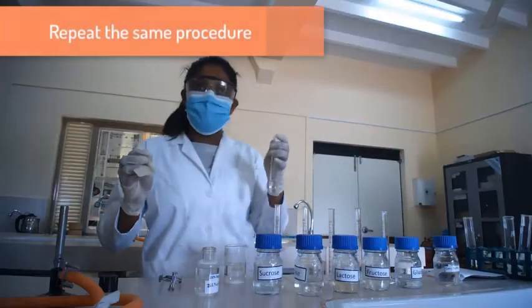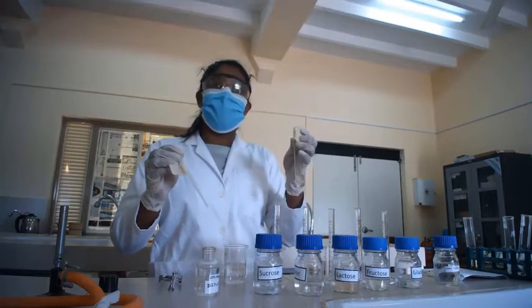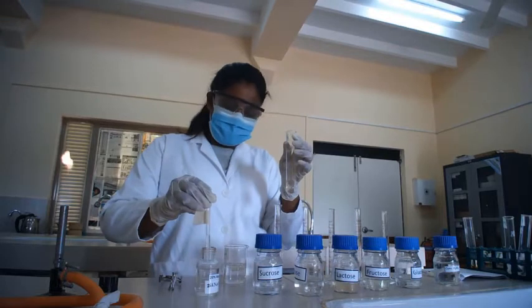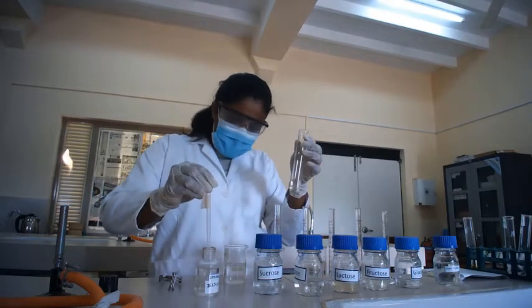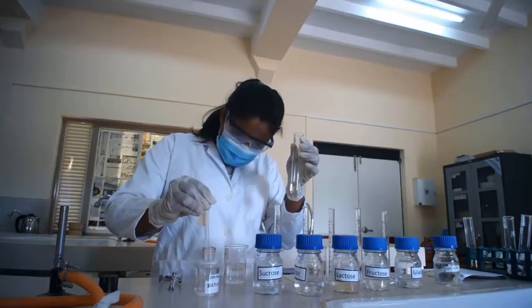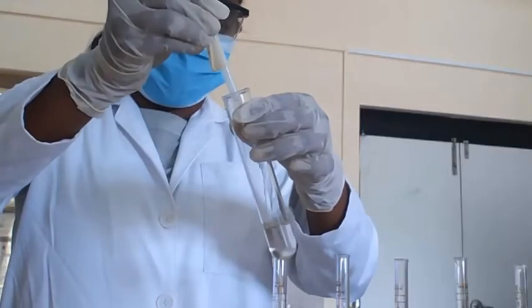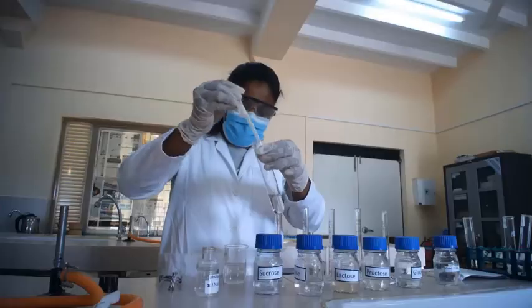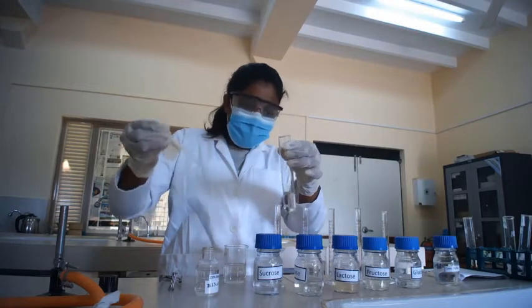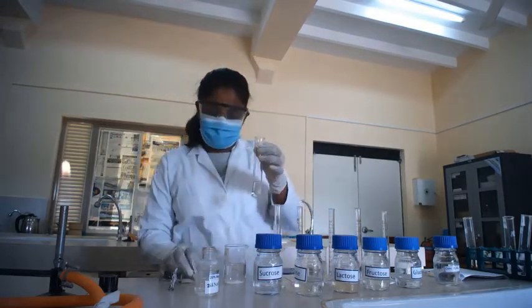We are going to do the same procedure for the other sugar solutions. Now I am going to add 5 milliliters of 20% sodium hydroxide to the lactose solution. After adding sodium hydroxide, you have to repeat the same procedure as I described before.